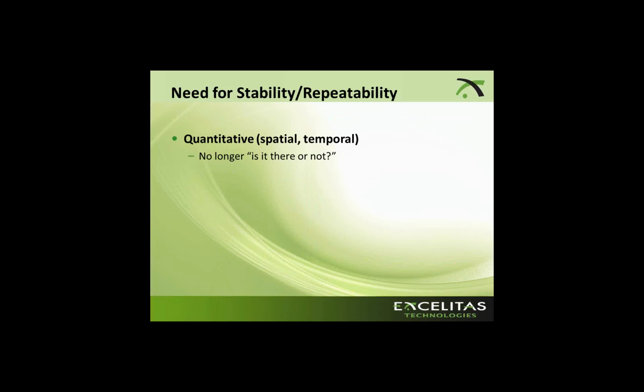With live cell imaging, there are more complex imaging parameters as well. You have to think of the media that you're imaging through. You have to think about photobleaching. You have to make sure that your sample is happy. And you have to think about whatever's happening within the cell physiologically. What I'm trying to say here is that you want to make sure that it's not your light source that is causing the difference between your images. You want to make sure that it's your actual experiment.